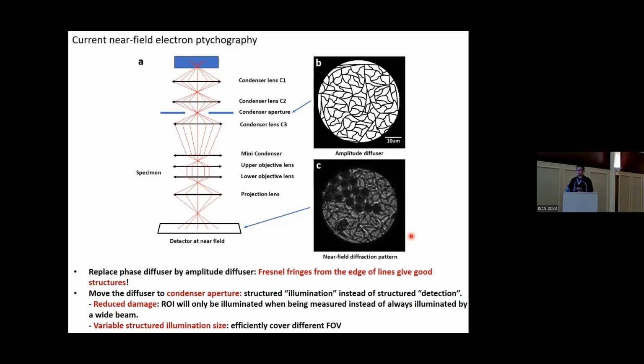Yes, so basically you're changing just the amplitude, as you mentioned, in this binary way, right? Yes, it is. Okay, and this is supposed to be a further step from the phase diffuser, because I didn't really get... Yes, well, because the phase diffuser is not a hollow design, the electrons will always be slowed down by the phase diffuser.